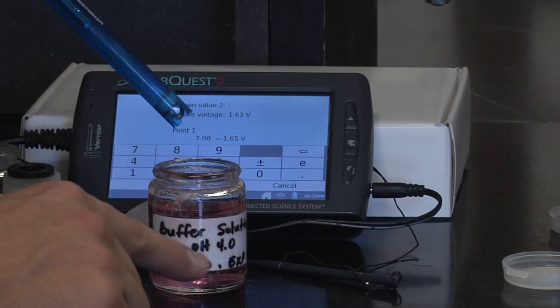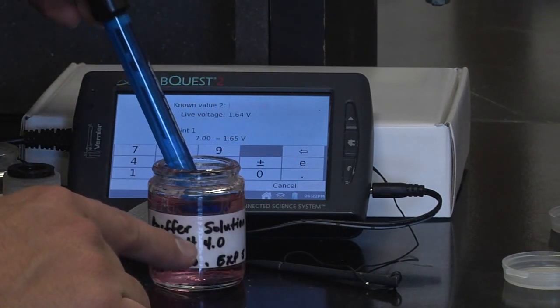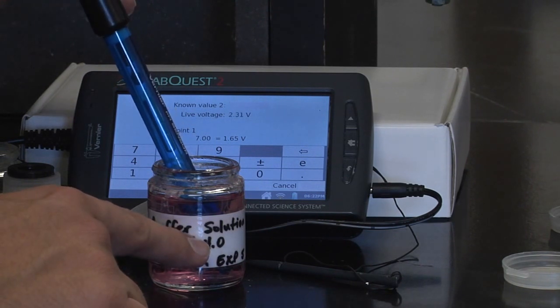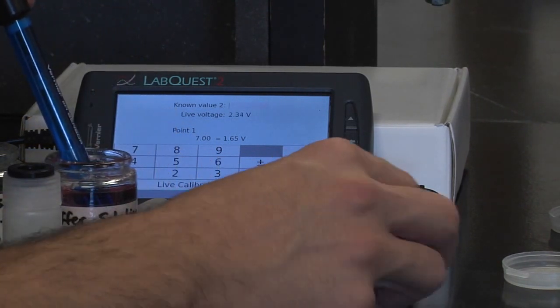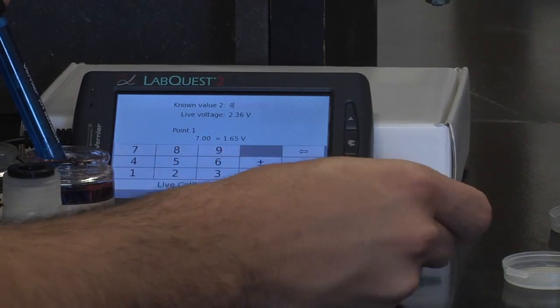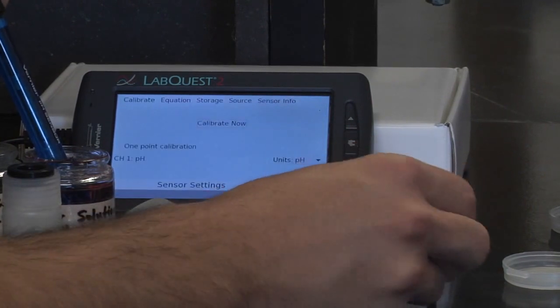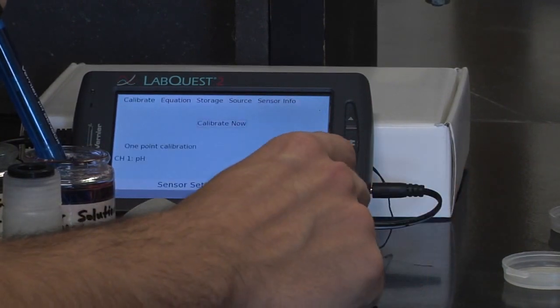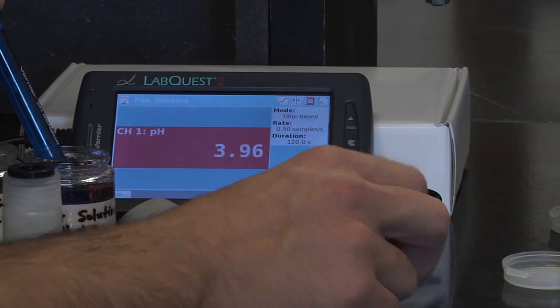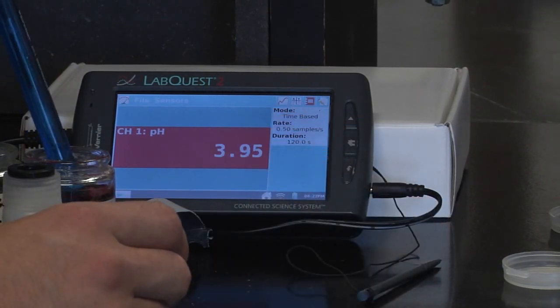and insert it to a new buffer solution. This one has a pH of four. So we will then go ahead and press four and press keep. Our pH probe should now be calibrated and should have a fairly accurate reading of our buffer solution.